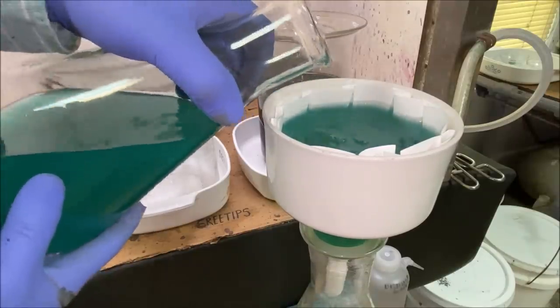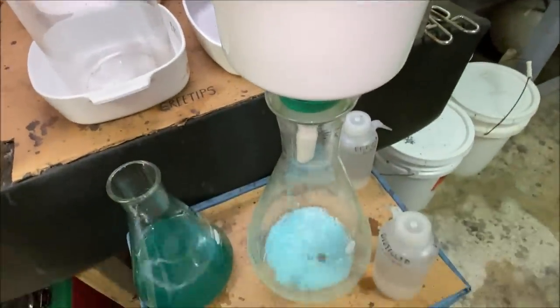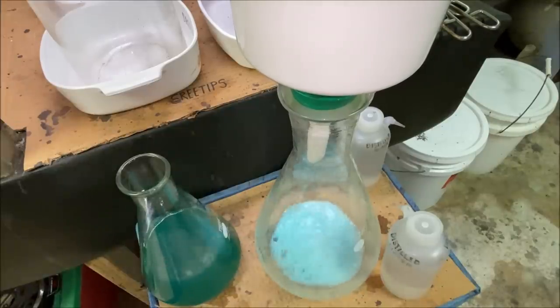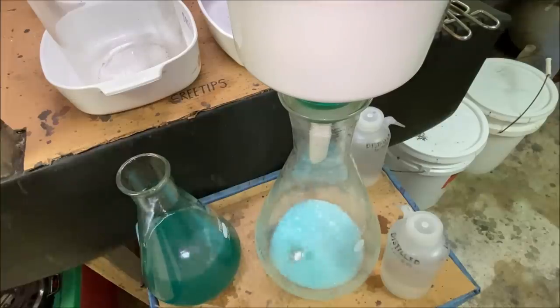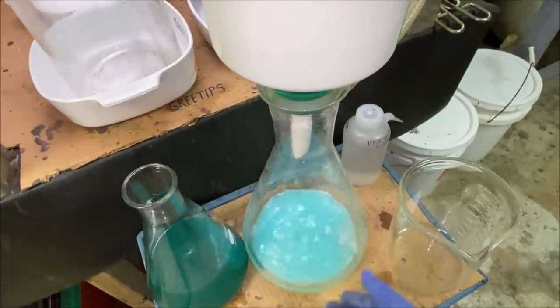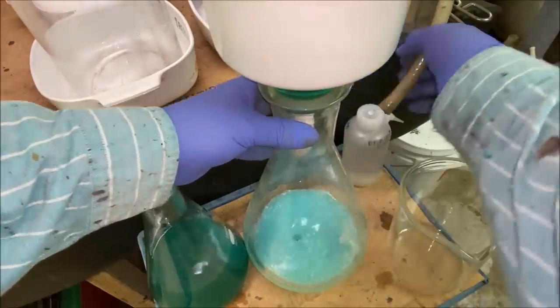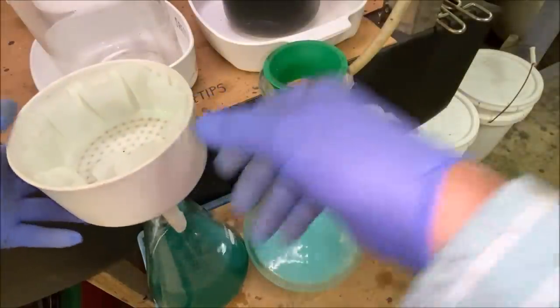Oh, Lord. I had evidently some hydrochloric acid down in the bottom down there. So now we're forming silver chloride. Made a mistake here. All right, I was trying to take a shortcut. Use a flask that had some stuff in it down here without washing it first. And now it's going to end up costing me more time trying to take a shortcut.